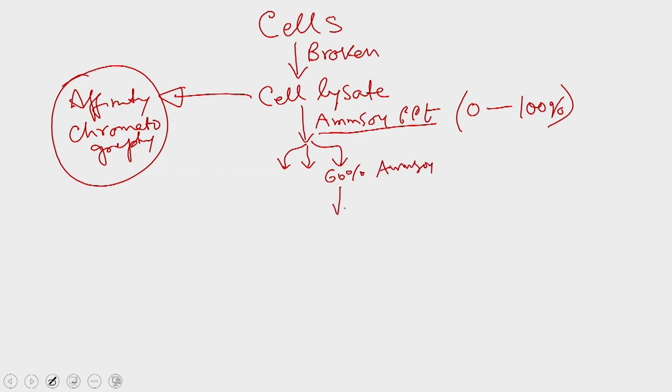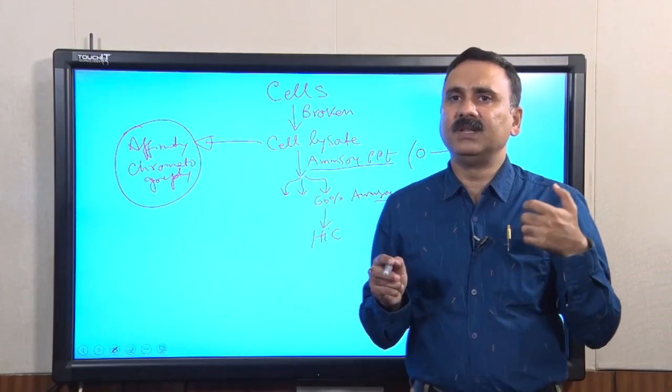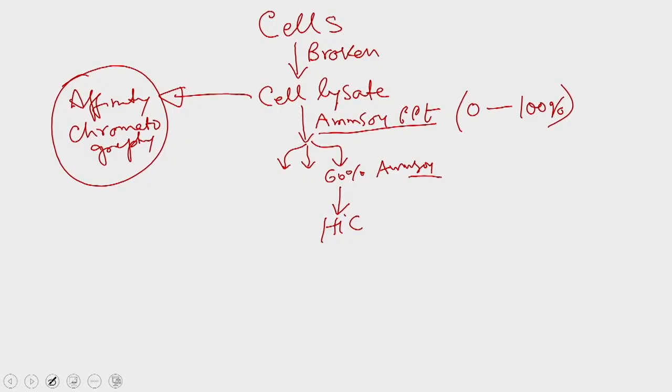What I'll do is, directly start running the HIC column. If you remember, we have discussed this in the past also, why HIC is a preferred column before the ion exchange chromatography: because you already have the ammonium sulfate in this solution. You can directly add some more salt, which is required for the exposure of the hydrophobic patches present on these proteins, and then you can directly run the HIC. Once you are done with the HIC, you are going to get different fractions.